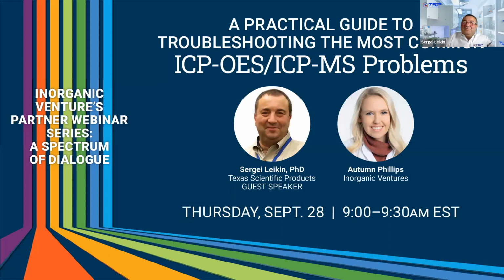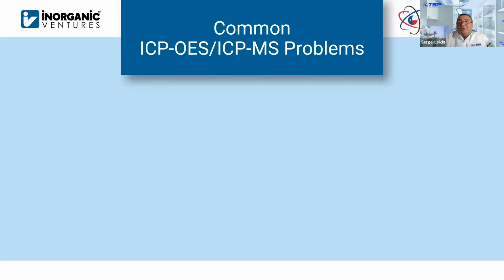All right, thank you very much, Autumn, and thank you everybody for joining us. I also want to thank the team at IV for inviting me and giving me the opportunity to share my experience with you today. The format of the webinar is to go through the very common ICP-MS problems that any analyst experiences on a daily or weekly basis. Then we'll leave hopefully about 10 minutes for a question and answer section.